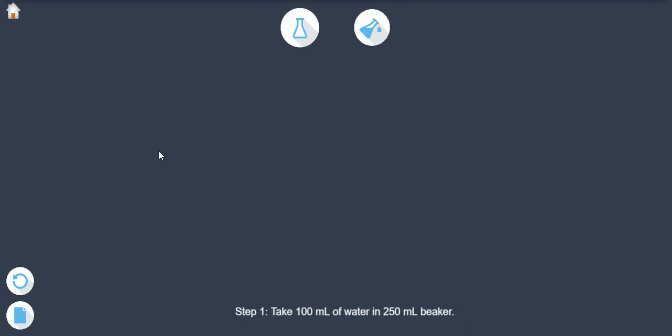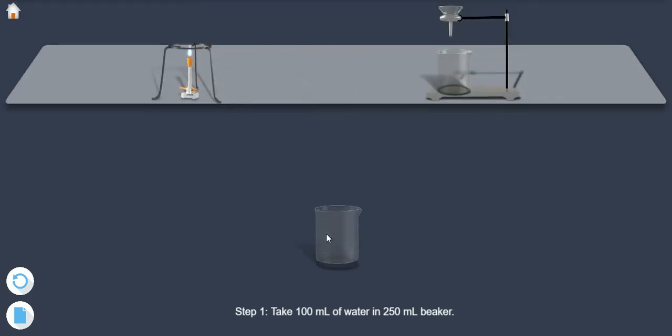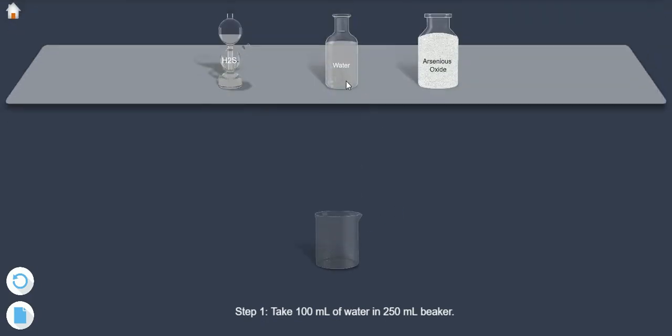Step 1: Take 100 ml of water in 250 ml beaker.